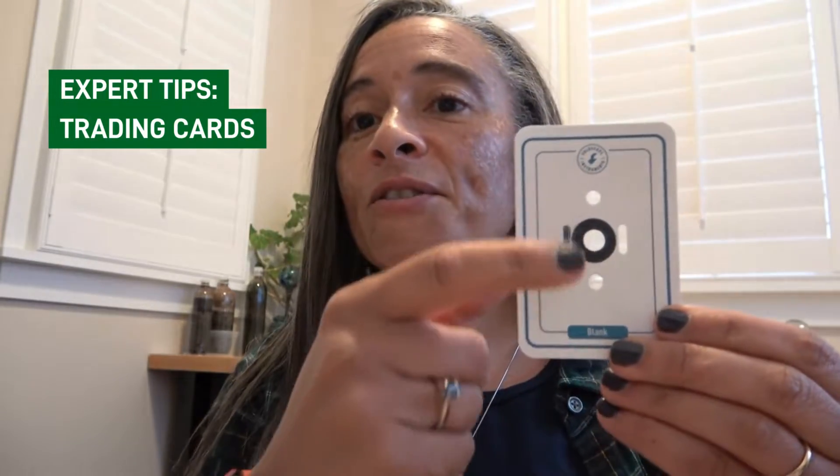You can also do water samples as well. Use a clear sticker on the back, and then instead of another clear sticker on the front, you'll use one of the ring stickers. Remove the plastic cover, put a drop of your liquid in there, and then seal it back up again.